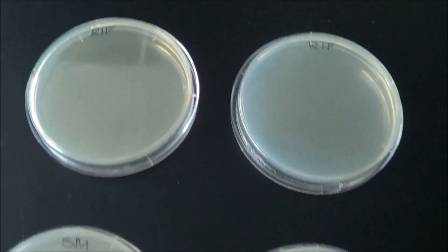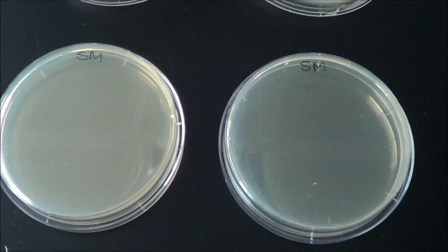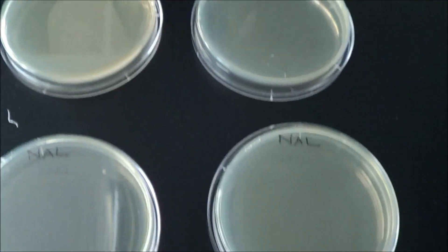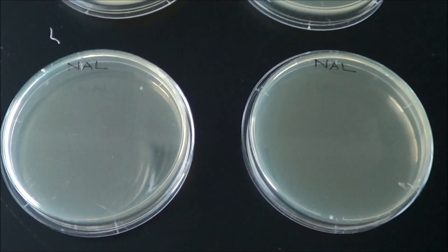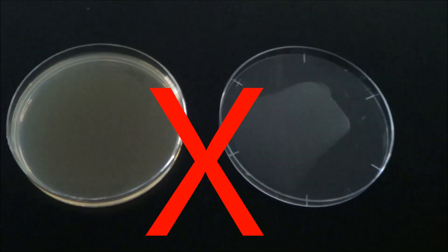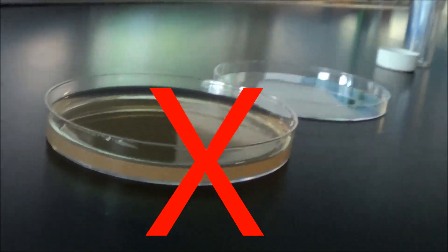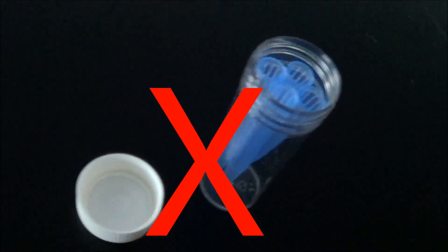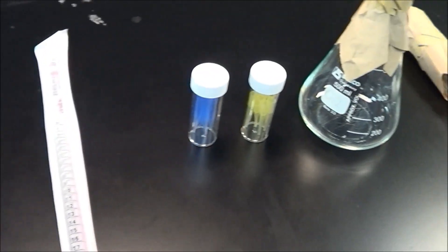Aseptic techniques are procedures that we use to prevent contamination from occurring in our solid or liquid bacterial cultures. These techniques include things like not leaving your agar plate open for too long, and making sure you close lids on bottles when you are not using them. Also, sterilization of all materials and equipment by appropriate wrapping and handling are important procedures for microbiology.